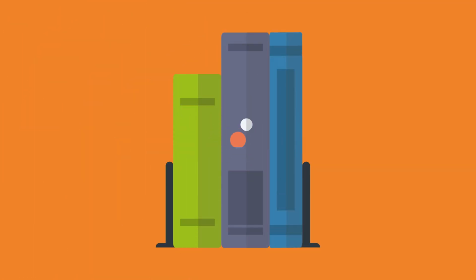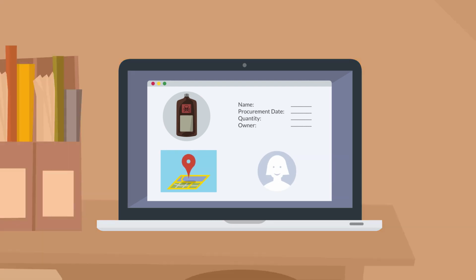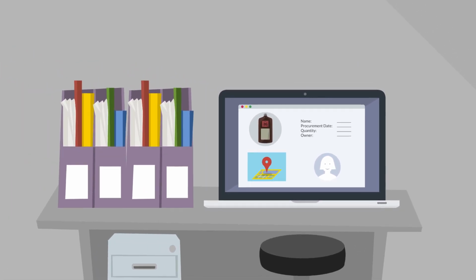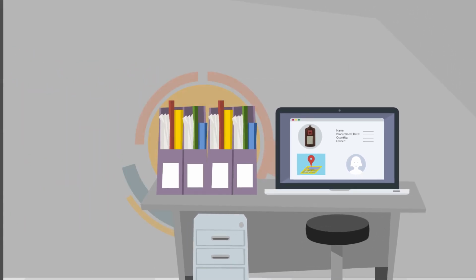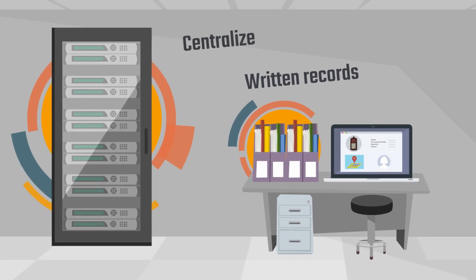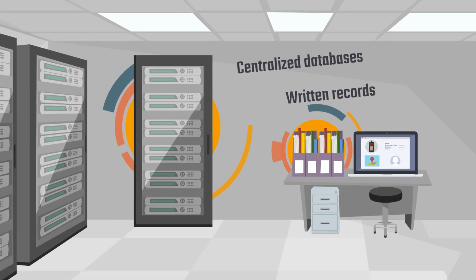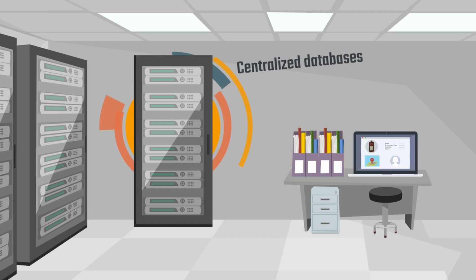A database can be as simple as a paper-based list or computer spreadsheet. Advanced inventory systems driven by a computer network can offer the most robust features for chemical inventory management. There are many commercially available systems that continuously guide inventory management to be more efficient and secure. Regardless of the system, the underlying database can vary in size and scope, and depending on regulatory needs, a variety of reporting options may be possible. However, systems that can handle more chemical and regulatory data will be able to generate more substantial reports.